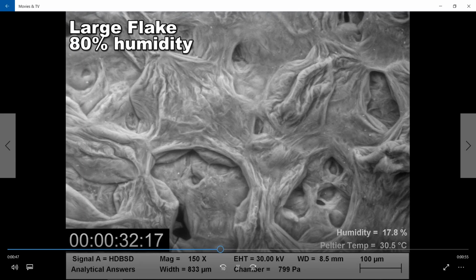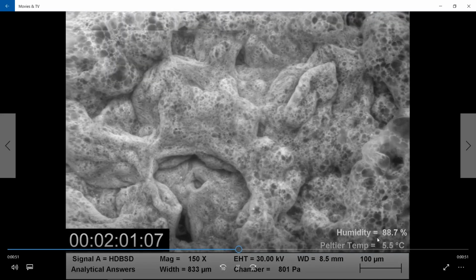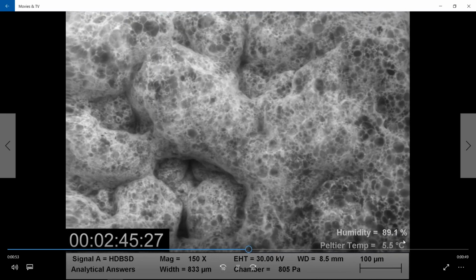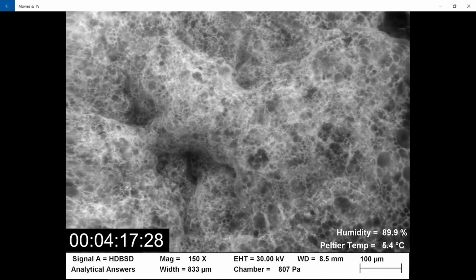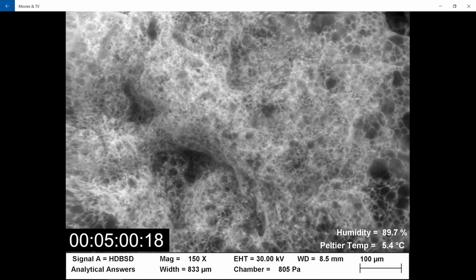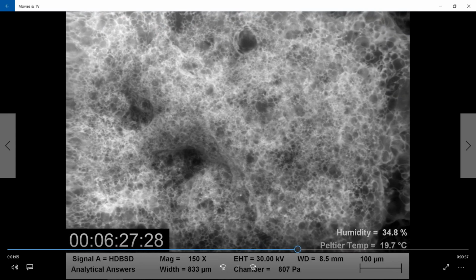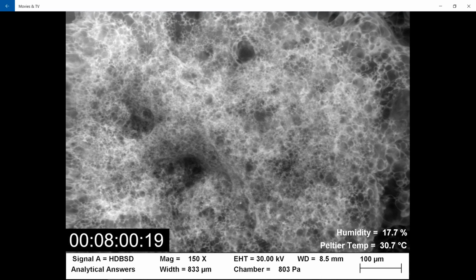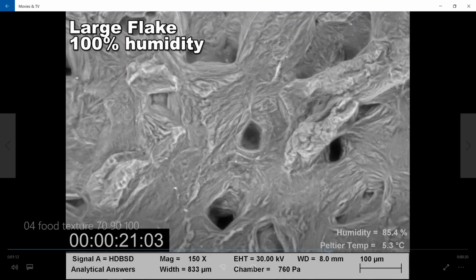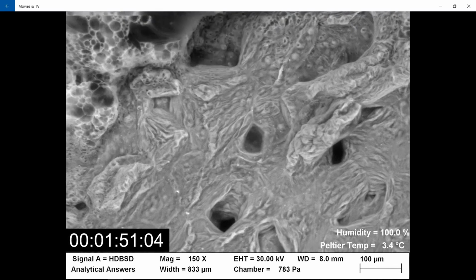So then we're going to switch to a higher humidity. And actually, if you look down in the lower right, this is up to 90%. And almost immediately, there's a much stronger reaction of the material at the 90% exposure. So clearly, we've crossed a threshold where the processing of the material went from a very stable state to a much more reacting state.